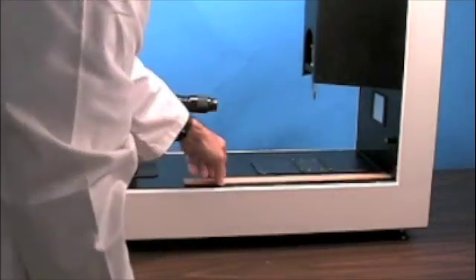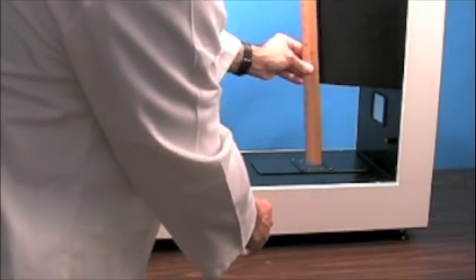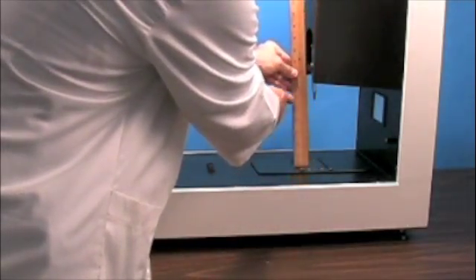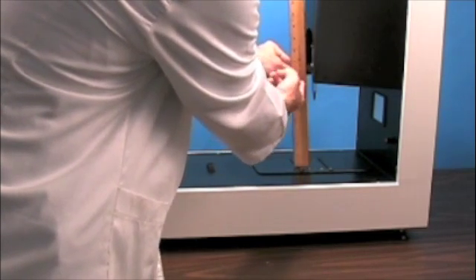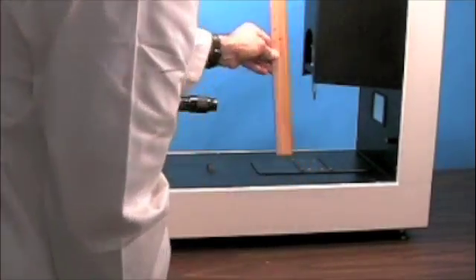As well as from the base to this spot here, we've got at least a good six plus inches. We can always have the syringe up a little higher, so good space there.